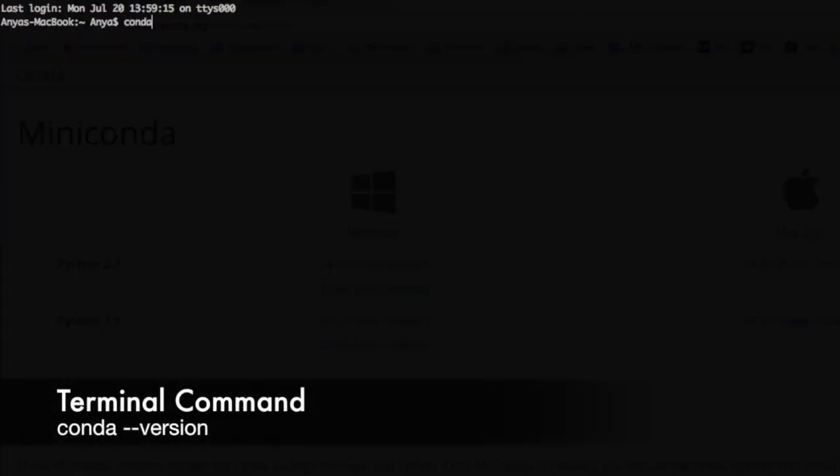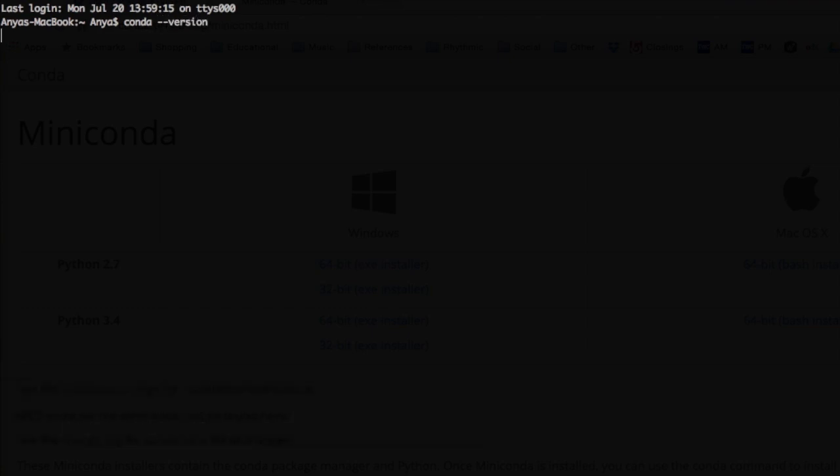You can then test it by entering conda --version into your terminal. If the installation was successful, a version number will appear.